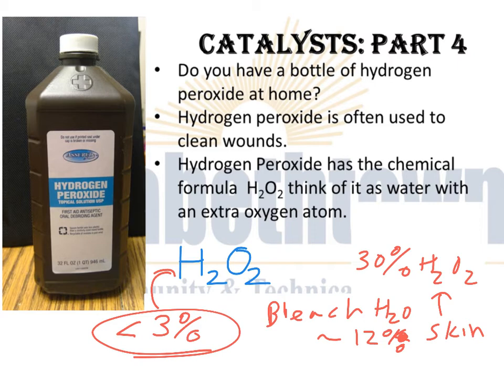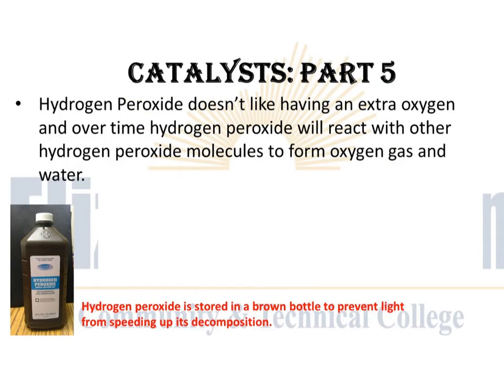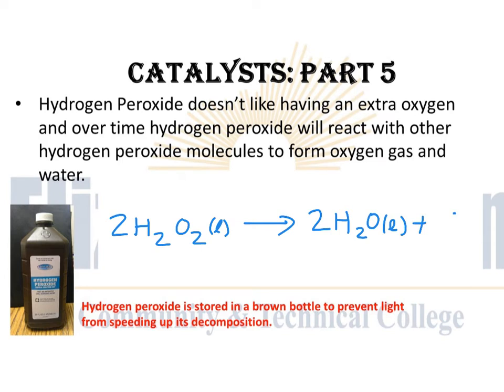Now, hydrogen peroxide doesn't like having that extra oxygen, and that's the reason it's kept in a brown bottle. Just a second, I'm trying to get my sheet of paper ready. Hydrogen peroxide doesn't like having that extra oxygen, and over time, two hydrogen peroxide molecules will team up and decompose to form two water molecules and oxygen gas.